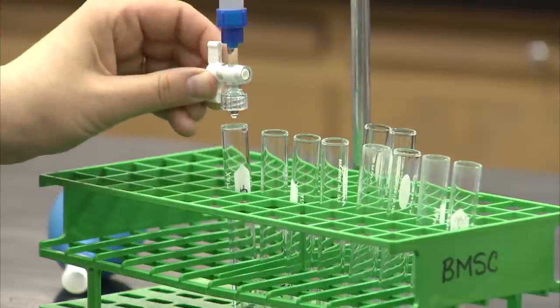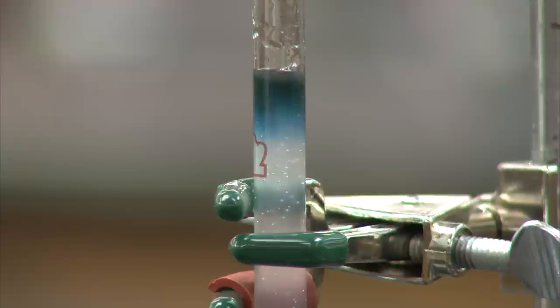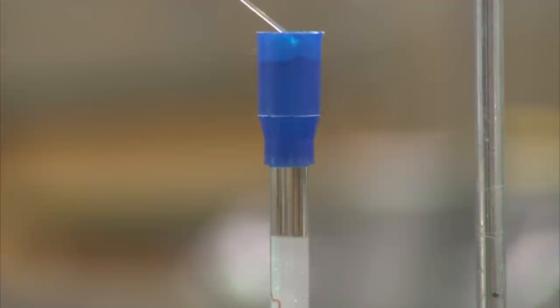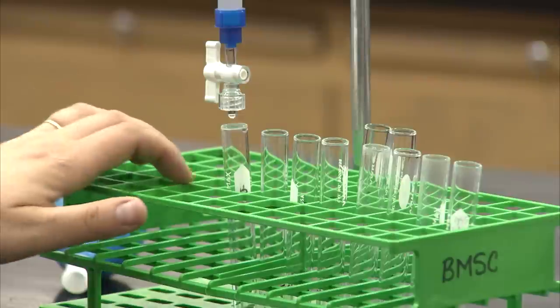When the sample reaches the gel bed, close the stopcock again, and add a layer of buffer above the gel bed to carry the sample through the column. The column can now be used in a continuous fashion until the samples are all collected, by adding new buffer to the top as samples are collected from the bottom.